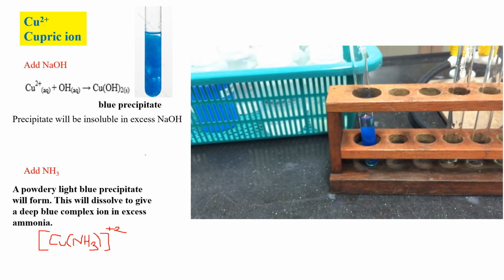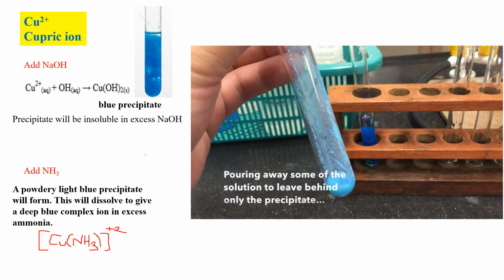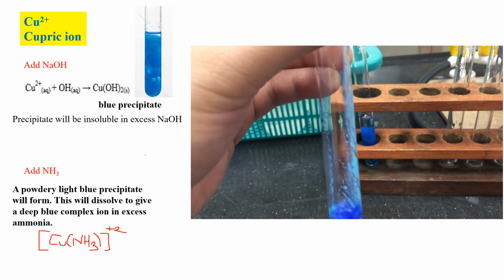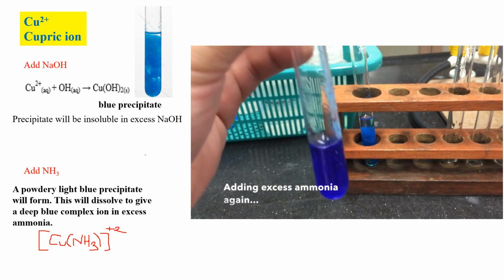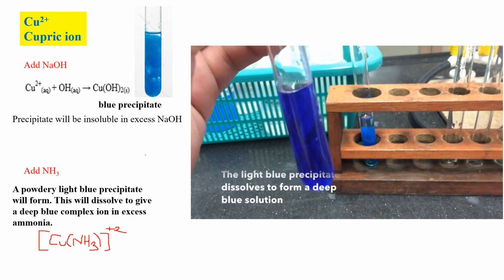This time you will see very clearly that the light blue precipitate dissolves to produce a deep blue solution.